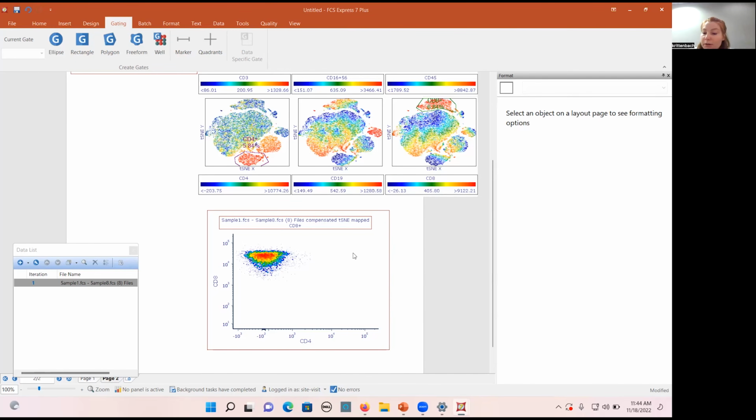Okay. So we have about 15 minutes left. I have one more thing that I want to go through with you, and that is integrated curve fitting and fit statistics. I guess while we are here in between those topics, let me check the chat.